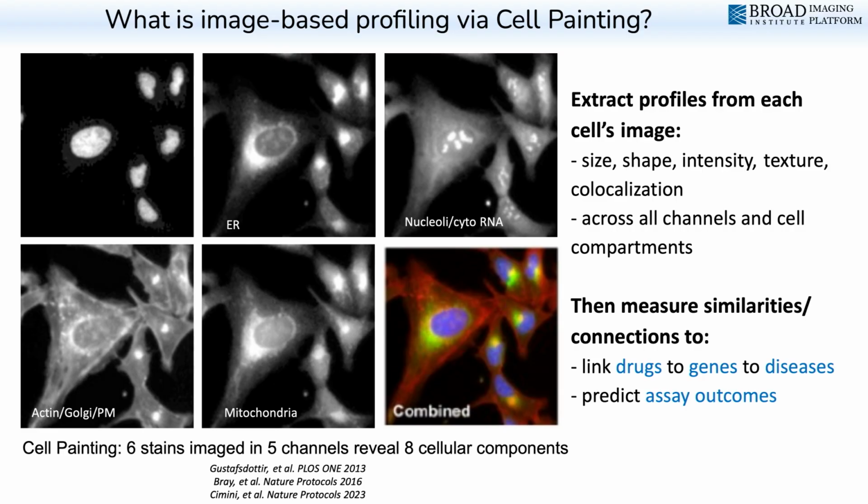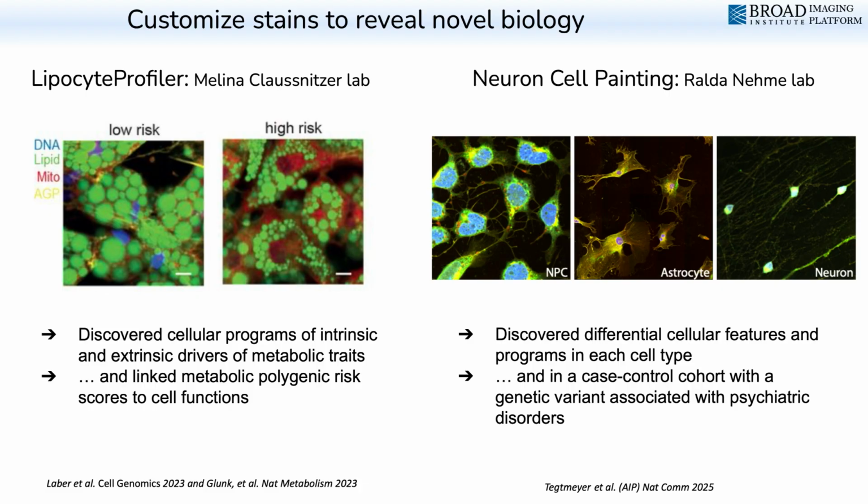It's a cheap assay. It's very easy to run. You can run it using a regular lab microscope, and it's a non-fussy assay, they just use dyes as opposed to antibodies. That's detail. And that has now made it a workhorse of image-based profiling. It's widely used in academia and industry for routinely profiling chemicals and genes, which we'll come to in a second, just to get their morphological fingerprint. Okay, so that's what cell painting is.